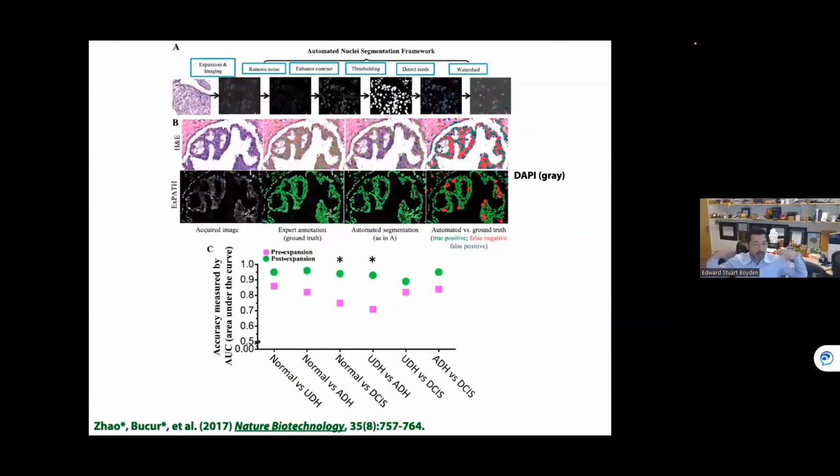Another example is early in a disease, it can be hard to detect the disease. In fact, that's almost the definition of early, right? The changes are small. We wondered, could we take those small changes and just make them physically bigger? So working with Stu Schnitt, a pathologist at Harvard Medical School, and others, we decided to look at early stage breast cancer. Stu and others had written a commentary piece that early in breast cancer, doctors can disagree about the diagnosis up to 50% of the time, half of the time.